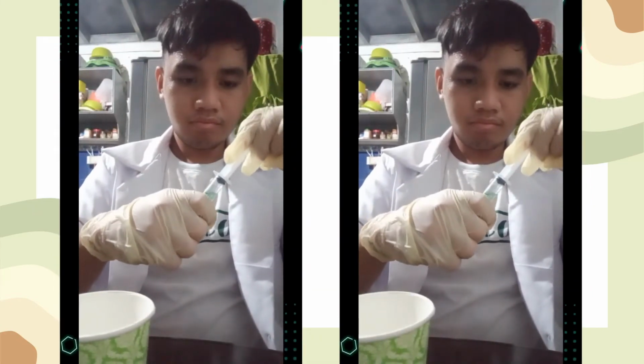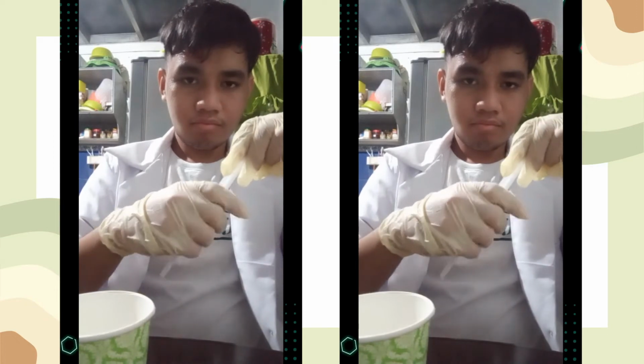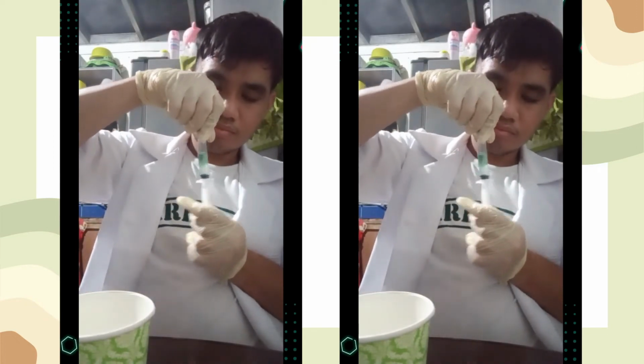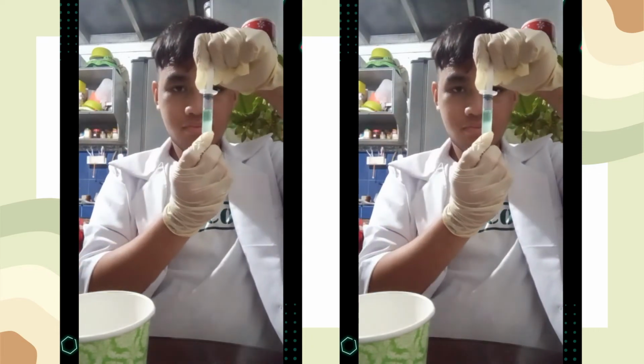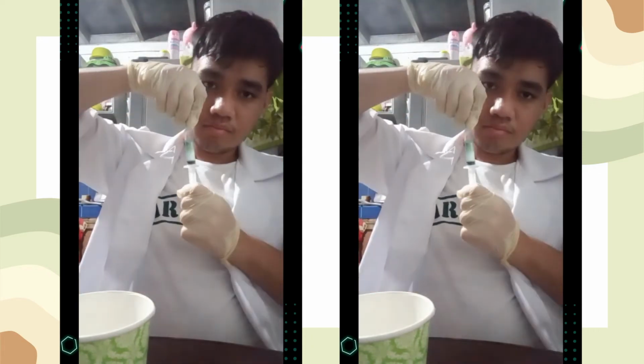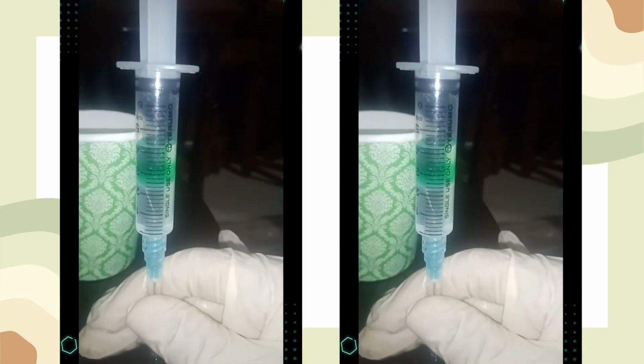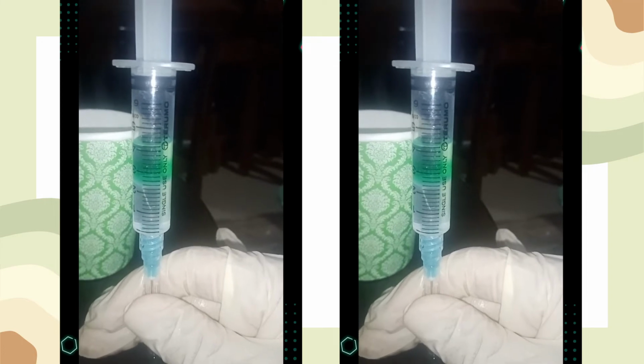Assuming that this is the cup, we're gonna tightly put the cup on the test tube and very slowly and gently tilt it upside down, then right side up 3 times. Do it carefully so as not to make bubbles. After tightly putting the cup, we're gonna wait for about 1 minute.